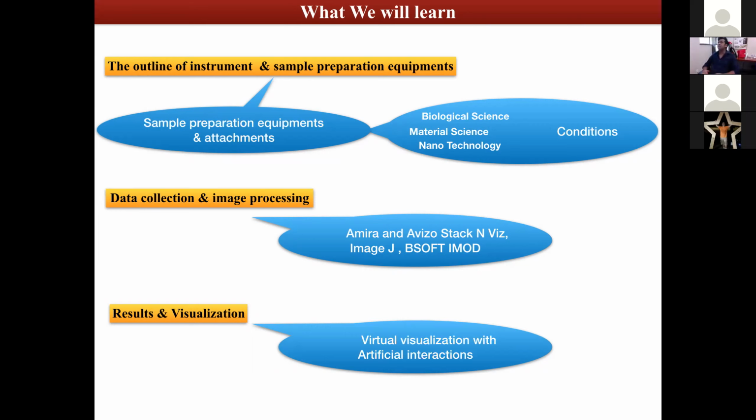So if you need some special filters, for example, if you need to apply a Wiener filter with a baseline corrector filter, you can write that program in Python code and implement it into the image processing code that we have. That is also available with us. Kindly note that you need to be very thorough when you're writing that program, and it is going to be very important.